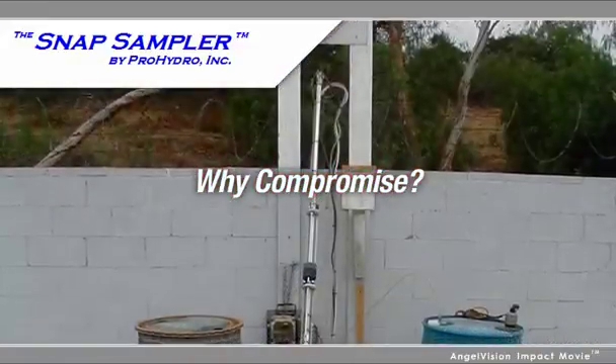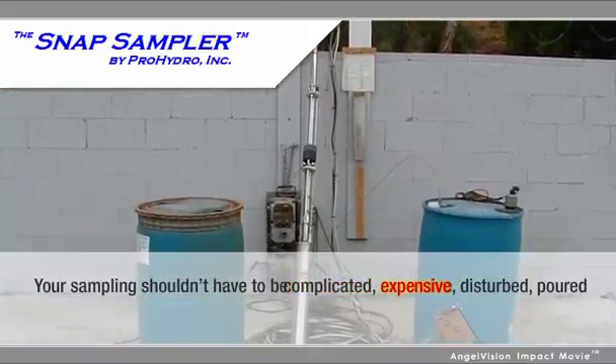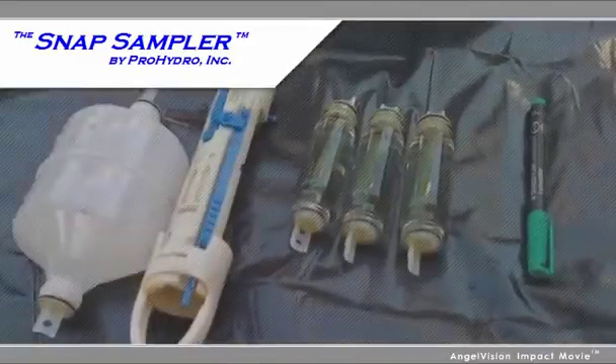Why compromise with other methods that require exposure of your sample? Your sampling shouldn't have to be complicated, expensive, disturbed, poured, or otherwise rendered less reliable.